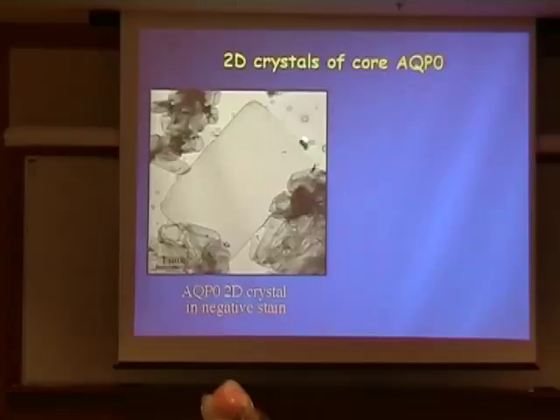So this material, both cleaved and uncleaved, that eventually went into making the crystals? Yeah, so this is from the core, but we have a mixture of cleaved and uncleaved. So you didn't do any further cleavage? So we actually did, we thought we were clever, so we took all the protein, cleaved it completely with chymotrypsin, tried to reconstitute, and we got huge membrane stacks. And so we couldn't use this at all. So the mixture was actually clever.